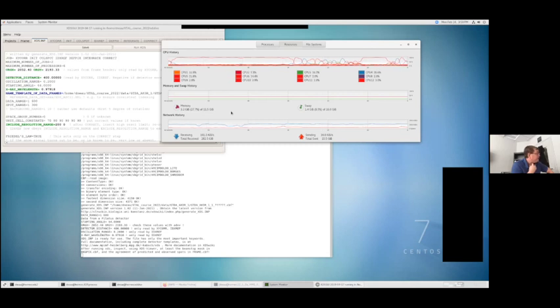When I run that on my desktop, I use jobs equal 2, processors equal 4. It took 110 seconds per job, for a total time of the integration step of 115 seconds. So you can see that by increasing jobs significantly, you can get much faster data.